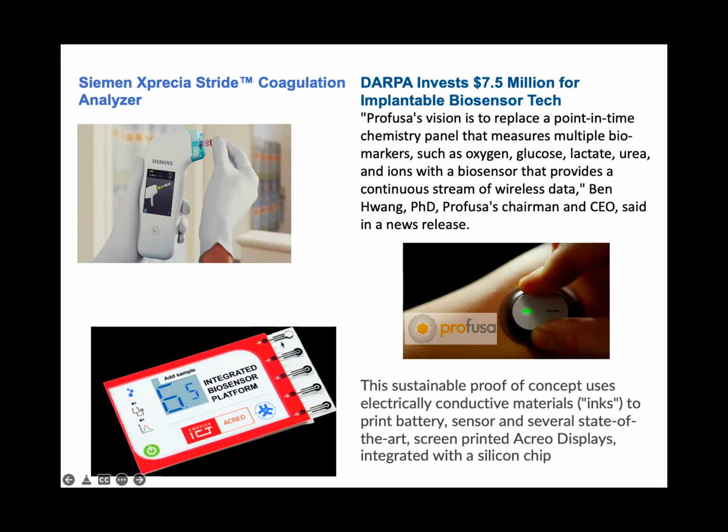But you can do multiple analytes at the same time. And the electrical circuit is quite simple, and it can just be printed on a very small size. The beautiful thing about using electrochemistry is that it can be miniaturized, made a very small size. So imagine you can keep this inside your wallet or your handbag, so you can do simple testing anywhere.